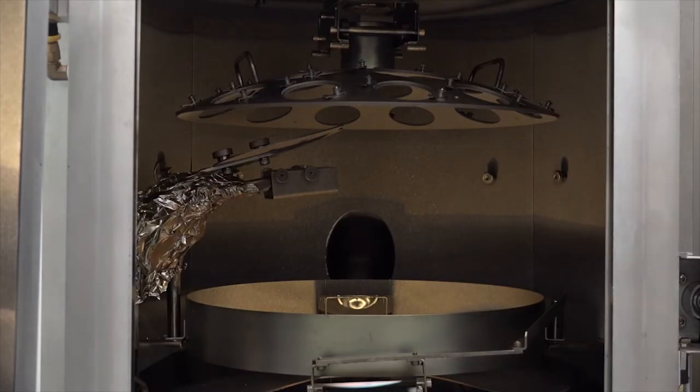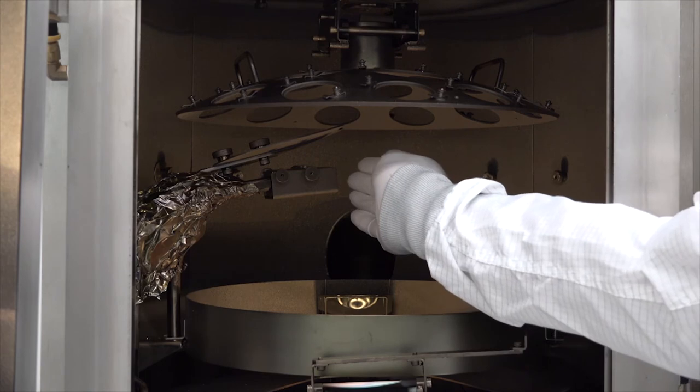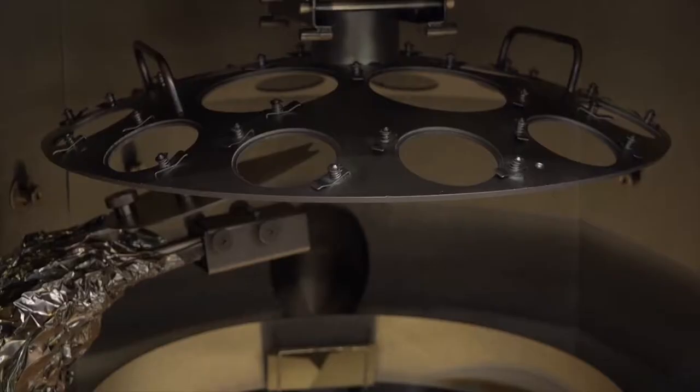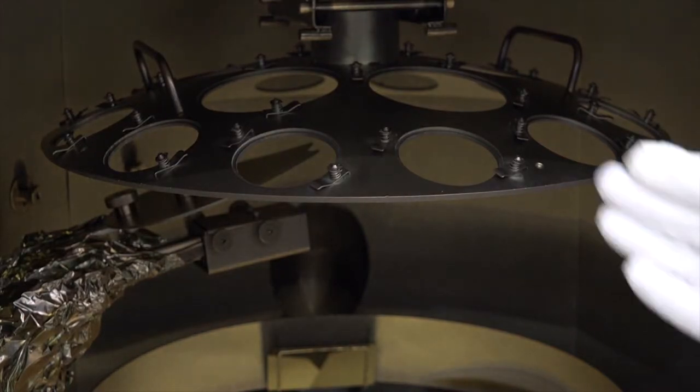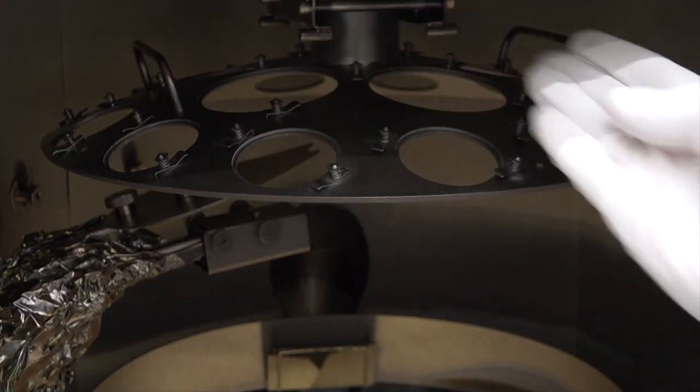The electron gun is located here. Remember, the electron gun is the source of the electron beam that heats the sample. And the sample is placed at the top of the chamber in this dome-shaped holder.